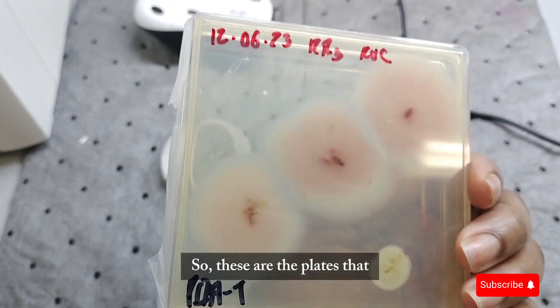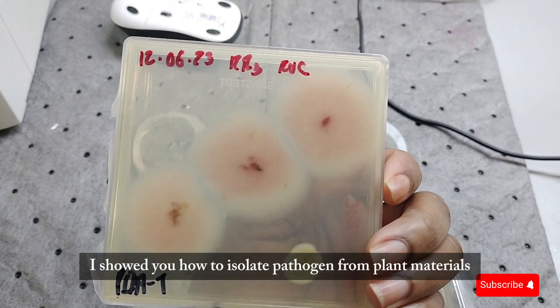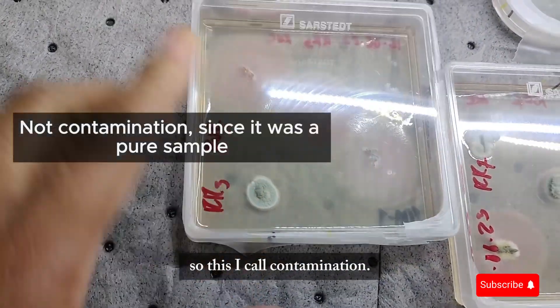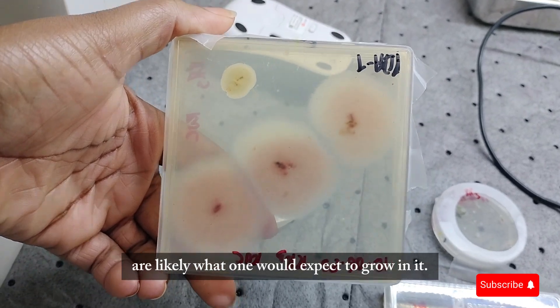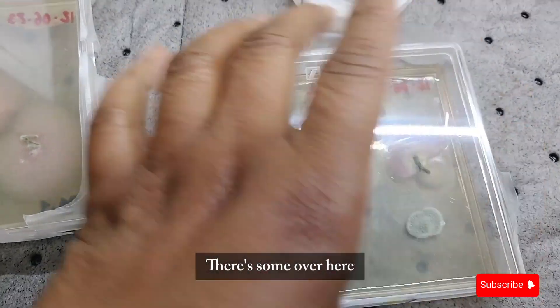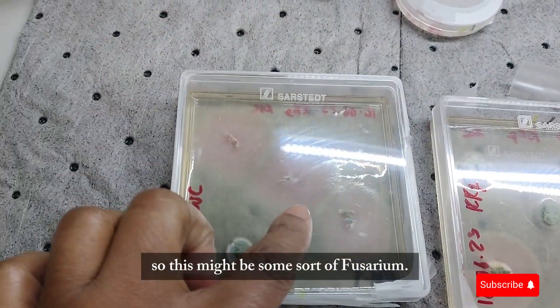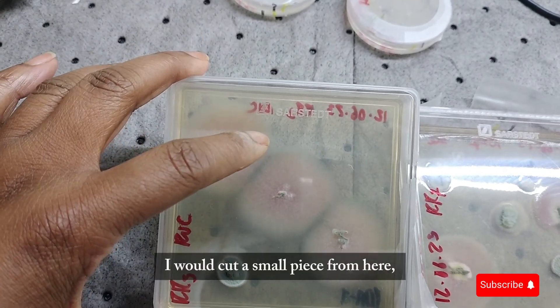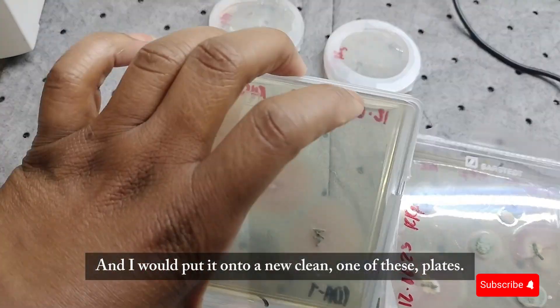These are the plates from the isolation of the pathogen from plant materials. Some of what's growing I call contamination, and these other ones — the pinkish ones — are likely what one would expect to grow. There are some other things growing on it too. This might be some sort of Fusarium. What I would do in a continuous process is cut a small piece from the very corner — the growing edge — and put it onto a new clean plate.